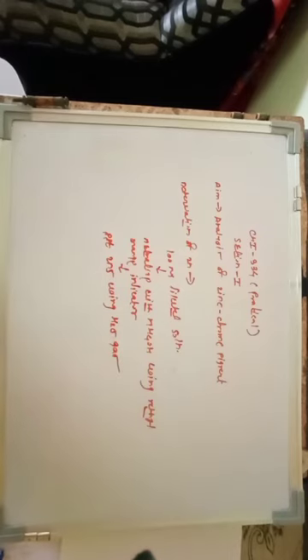So I take the diluted solution, neutralize with NH4OH using methyl orange indicator, and precipitate zinc as zinc sulfide using H2S gas.